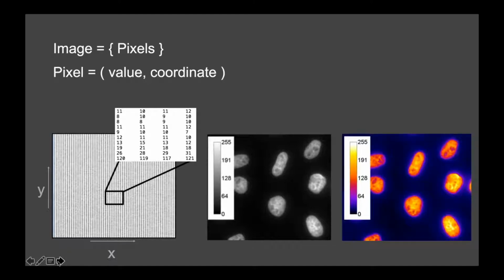This is not the only thing you can do. Actually, another quite popular choice is these false color lookup tables. And that, for example, as you can appreciate here, helps you to also see the dark halo around the nuclei better, which is not visible in the grayscale lookup table. So I think there basically everything is possible. The point is just it's best practice to show in your images this scale bar here, so that people can really understand which number belongs to which color.